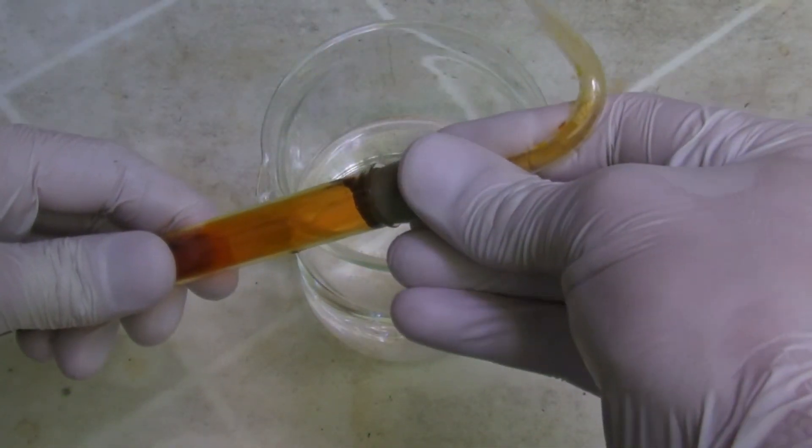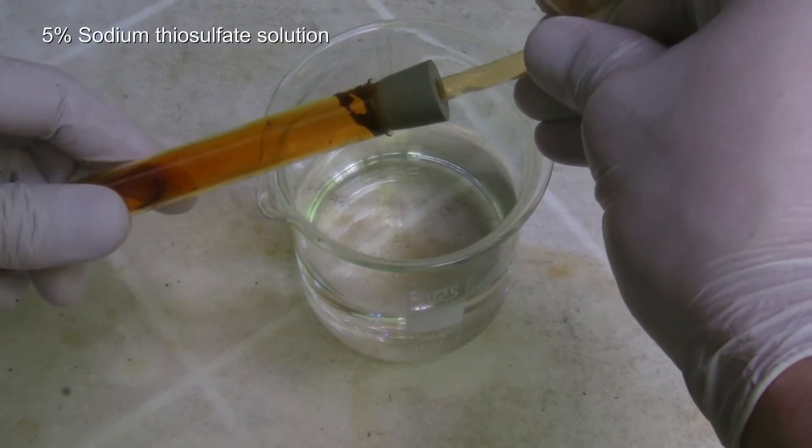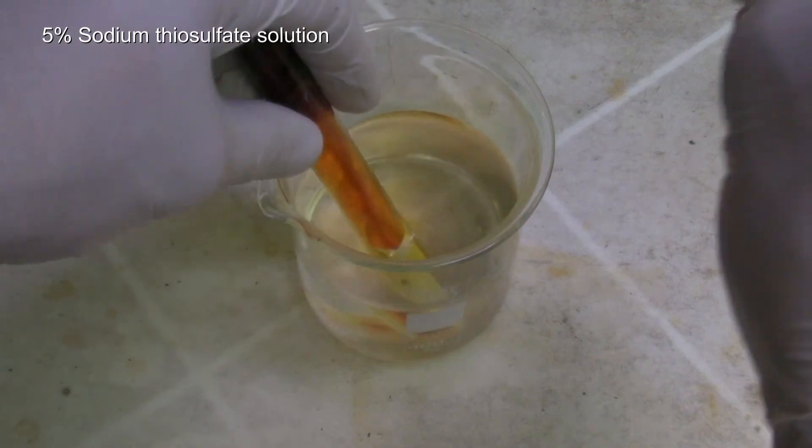When the test tube has cooled down, the stopper can be removed quickly and the rest of the bromine is neutralized with a 5% sodium thiosulfate solution.